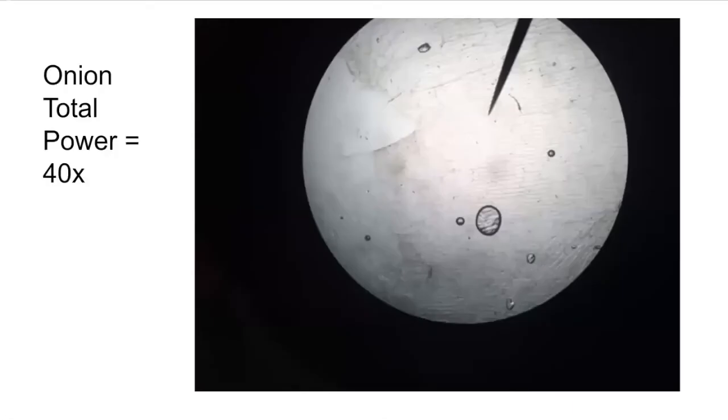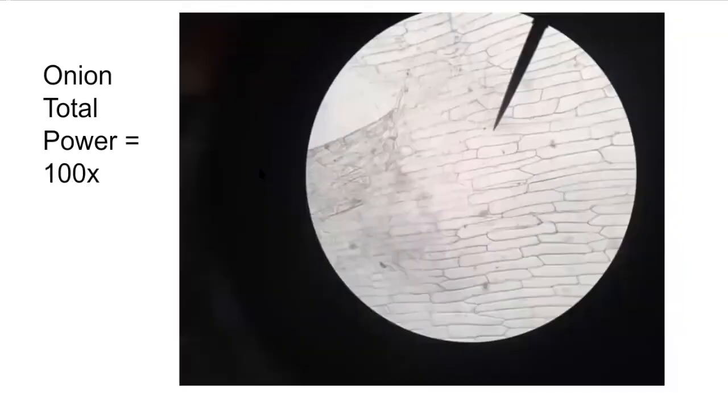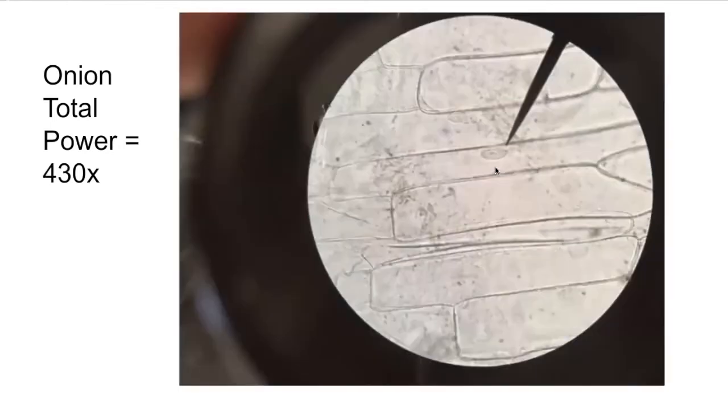So this is our onion on low power, and we can see the matrix of cells. They're made up of these little blocks that look kind of like a brick wall. As we increase our power of magnification to 100 times, we're able to see in more detail, and these cells are going to be clearer. We're able to start seeing the nuclei in these cells. And as we go to 430 times magnification, we're able to see the nucleus very well. You can see the cell wall, the space between these cells, and you can see the cytoplasm, the inner goop that makes up the inside of a cell. And that's pretty much all that you're going to be able to see in an onion cell.